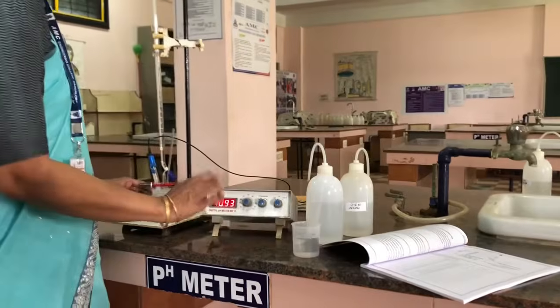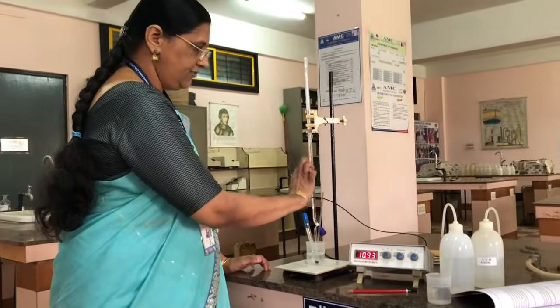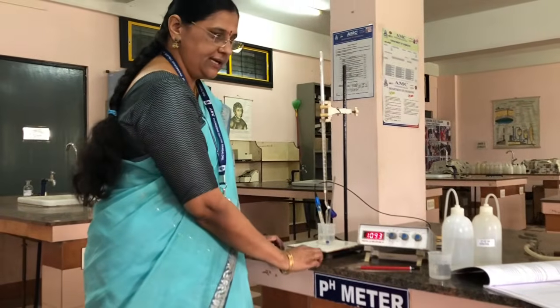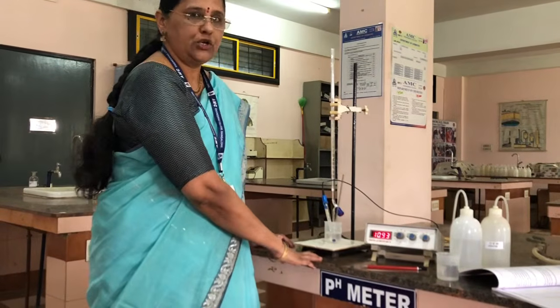So now we will stop doing the experiment. This is the completion of the experiment. That means after getting a jump in the pH, we have to take 2 more readings. Then we have to stop doing the experiment. This is the demonstration of the experiment.